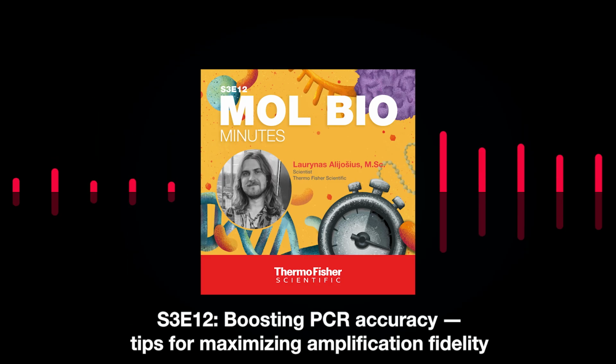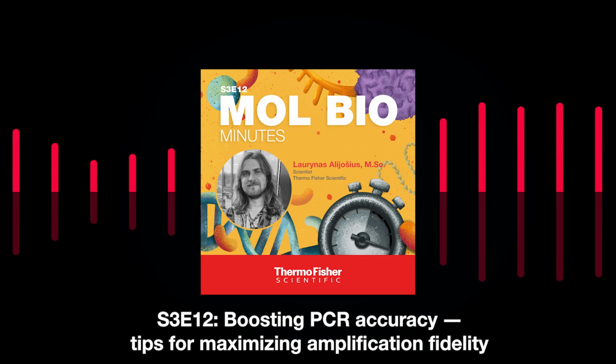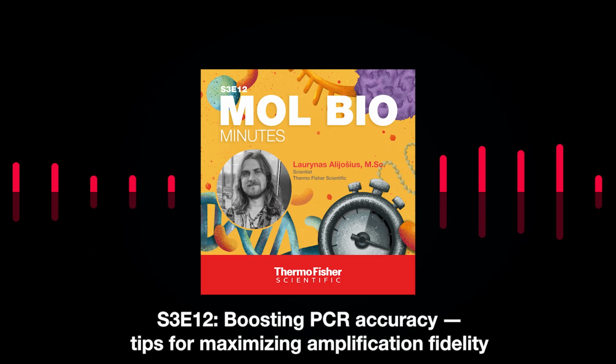Or if you perform too many cycles for your PCR, that can result in things like accumulation of errors, but also there will be a higher chance of non-specific amplifications in the later cycles.